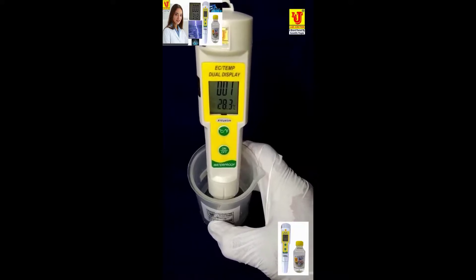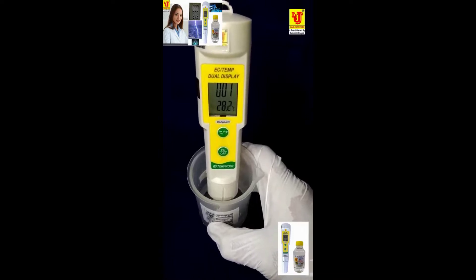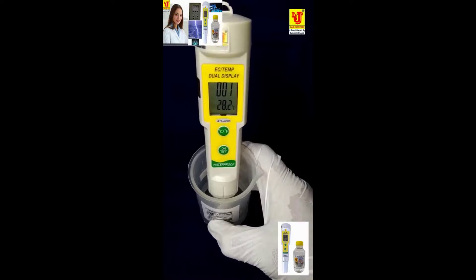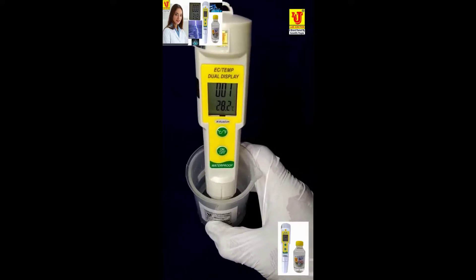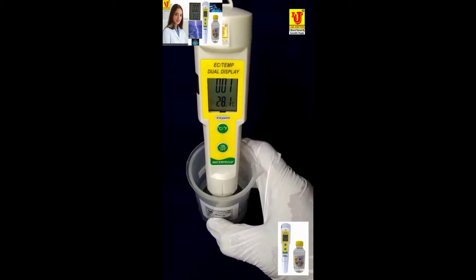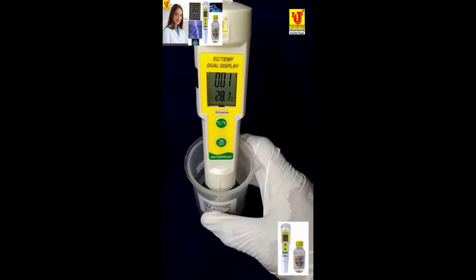For this meter, you have to use 4 button cell batteries. The battery type is LR44. Battery life is 300 hours — after 300 hours you have to change them. This is the complete demonstration of this EC temperature dual display meter.